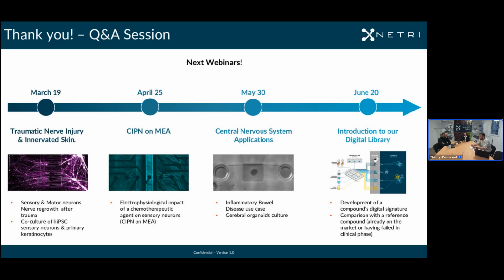Okay, thanks for the comprehensive answers here. There is another question about culturing neurons. To culture neurons, do you need to coat the compartment with specific extracellular matrix components?